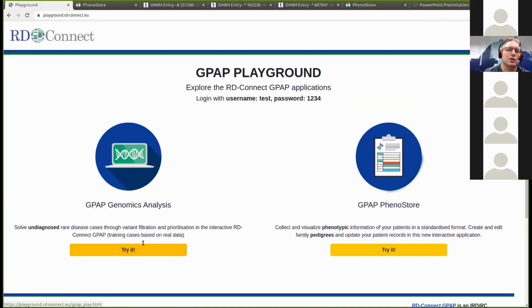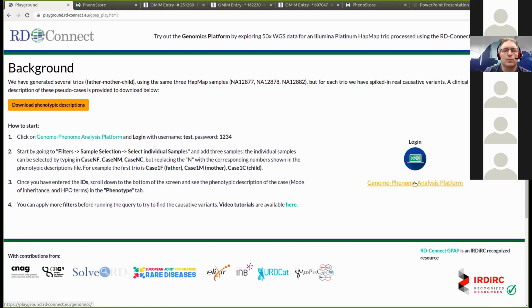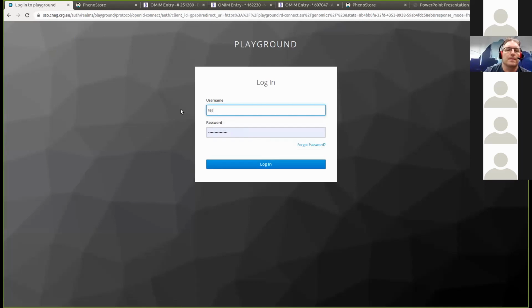And you have access to the genomic analysis module, which is what I'm focusing on today, but you also have access to the PhenoStore module to see how that would work. As I say, I'm going to log into the analysis module. All this information will be open to you after the webinar today, so you can try it yourself. The information is provided for the playground. The username is test and the password is 1234.